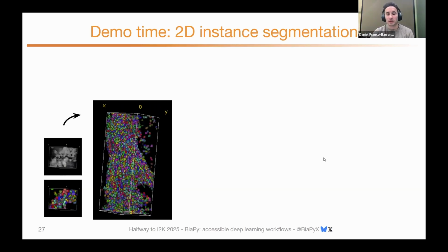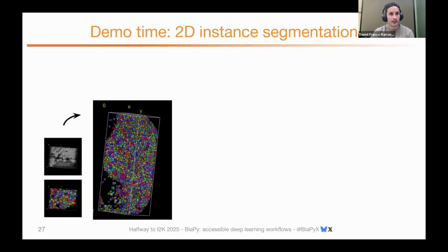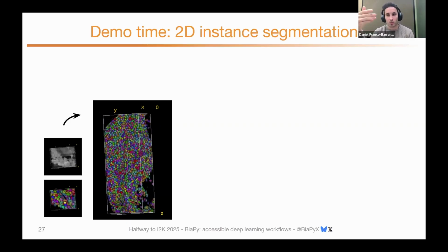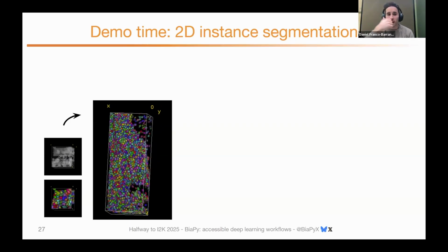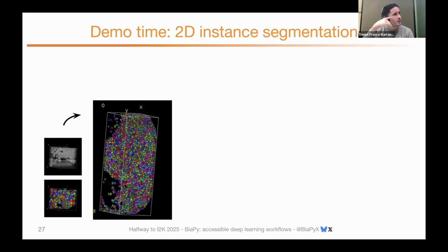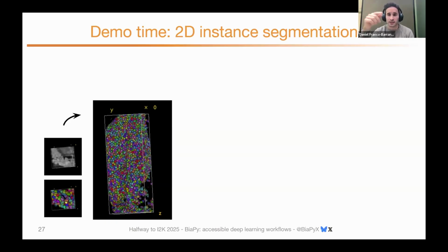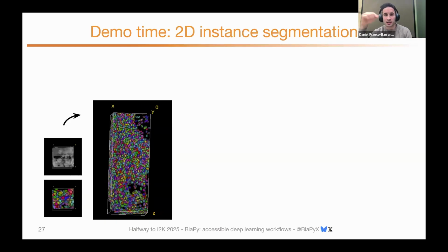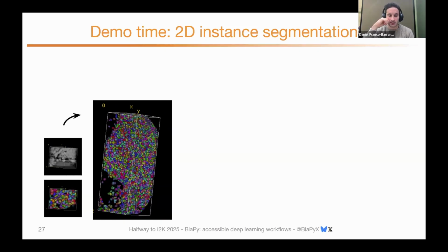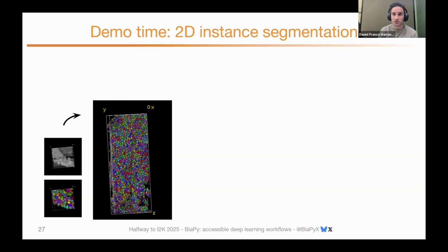But we want to use DINOv2 and DINOv3 weights, like in the last work of Cellpose. They are reusing the weights from DINO to do the segmentation task. So we are going to do that in the future also.